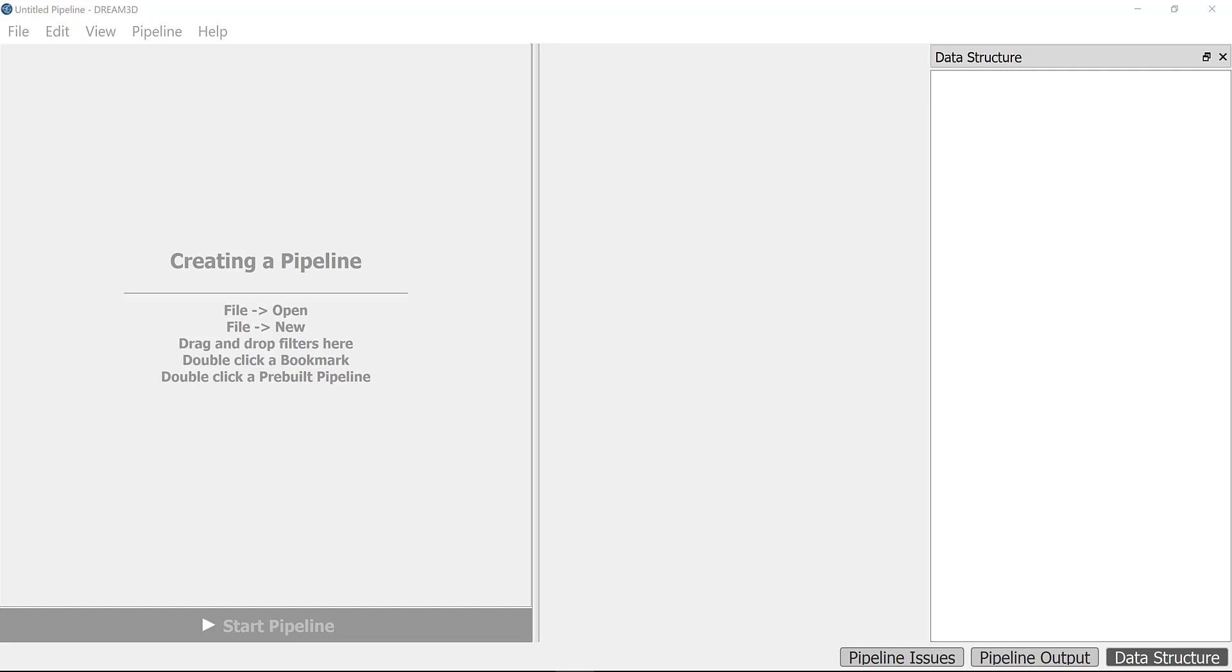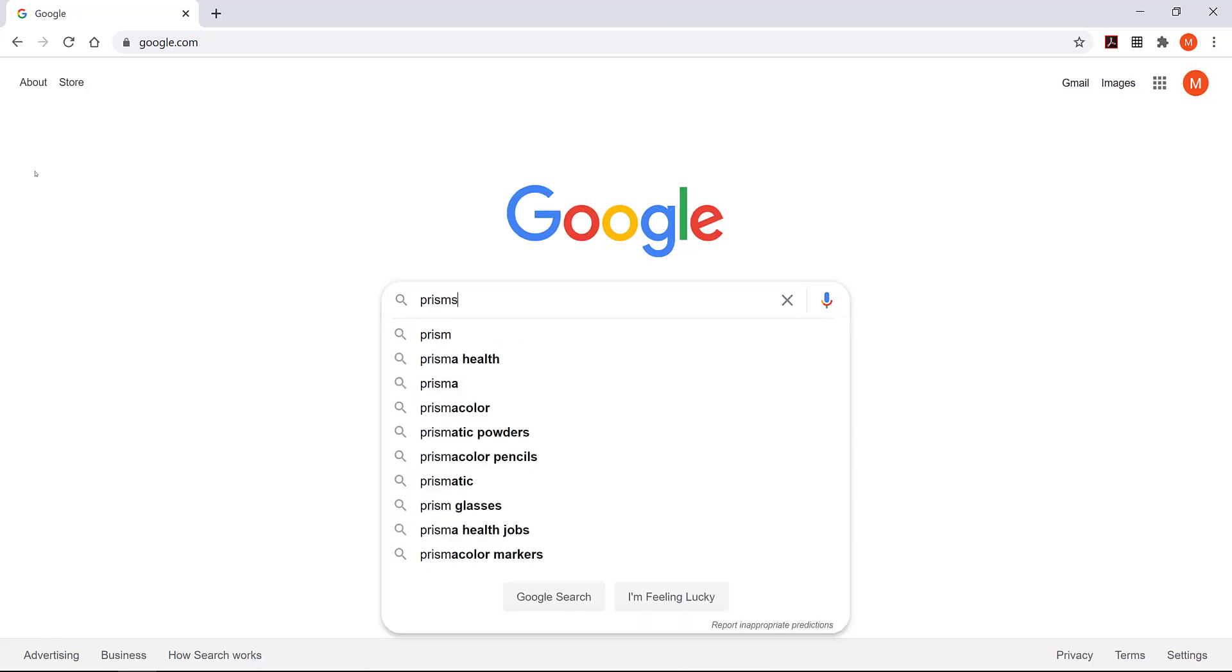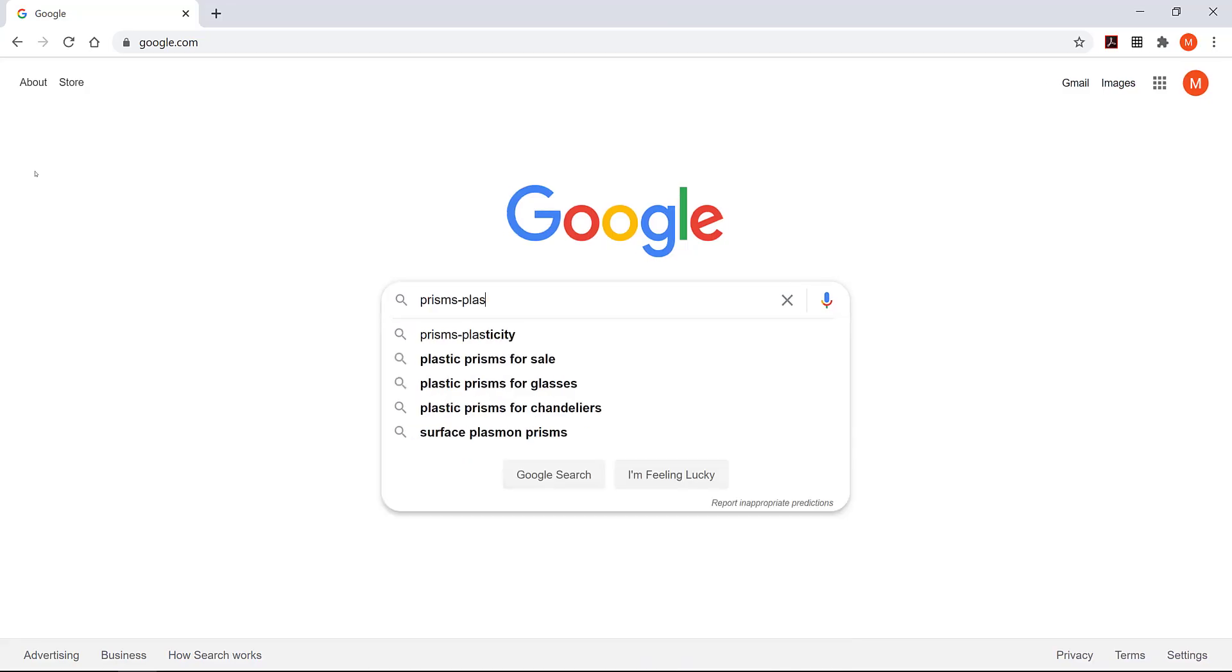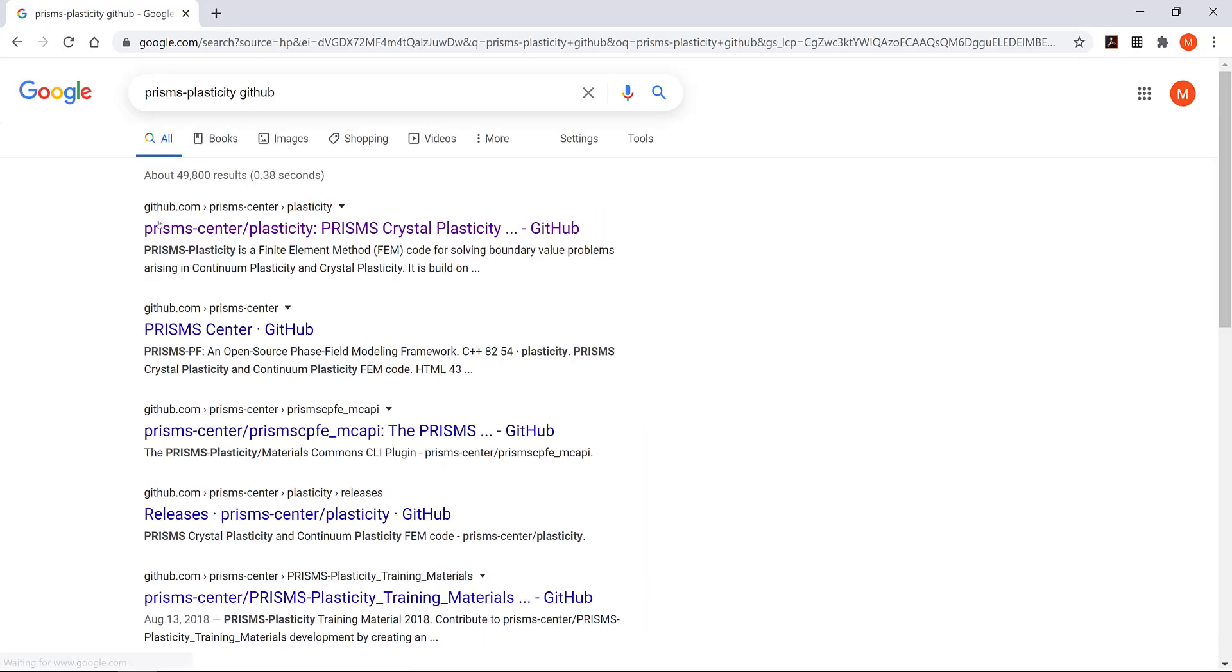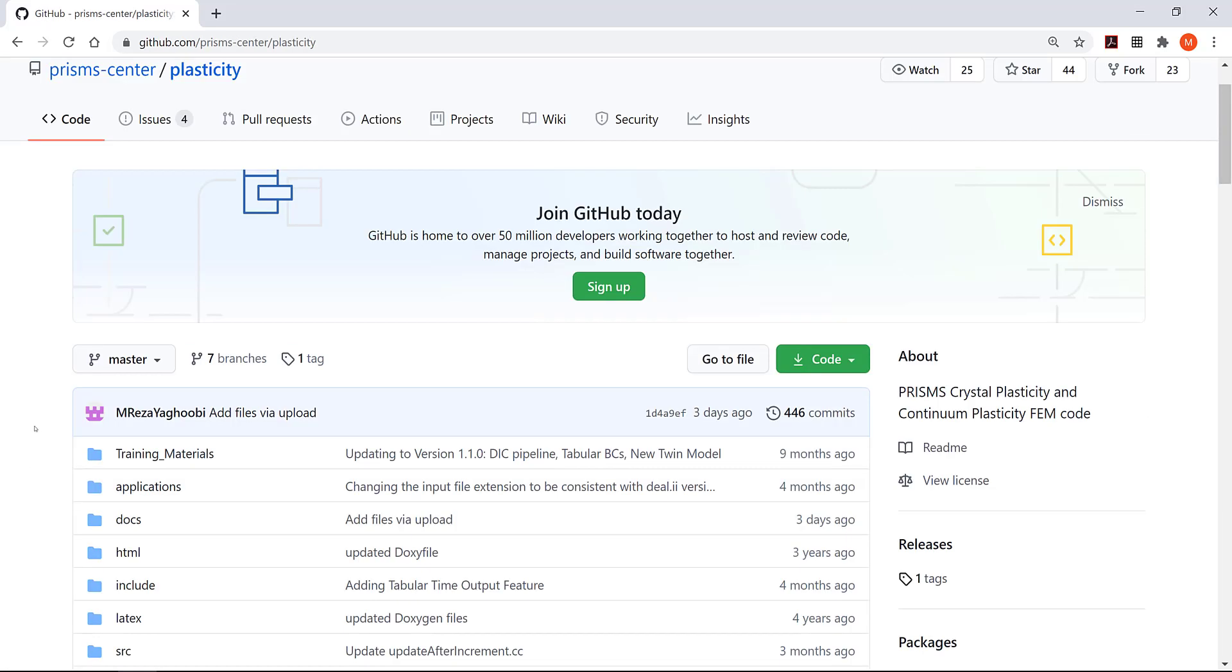There are some files that I need to introduce before we can start using DREAM.3D. If you go to Google and type 'PRISMS Plasticity GitHub' and click on the first link, it will be the PRISMS Plasticity GitHub package.